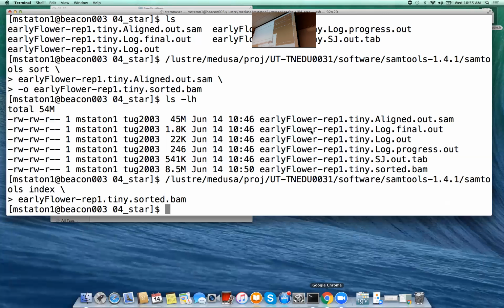All right, I'm going to show you how to load these files into IGV. The first thing is there may be some stuff up here, there may not, but we want to load our genome. If you go to Genomes, load genome from file, you're going to select your genome. That's the P-Persica 298 version 2.0 .fa. Open. You may get a pop-up that says it needs to be indexed. I think you just click continue or yes, and it'll index the file for you, and that might take a second. Did anyone get that?